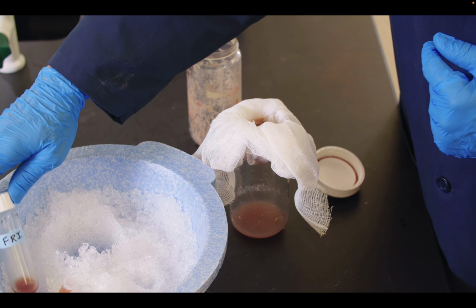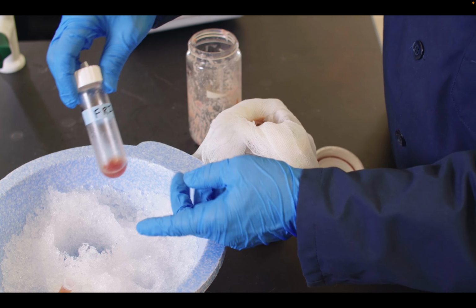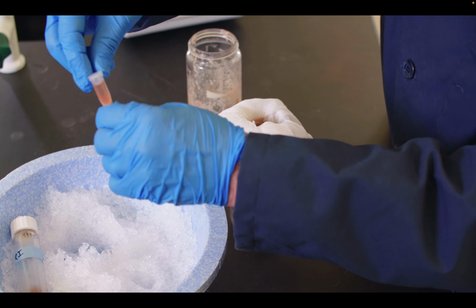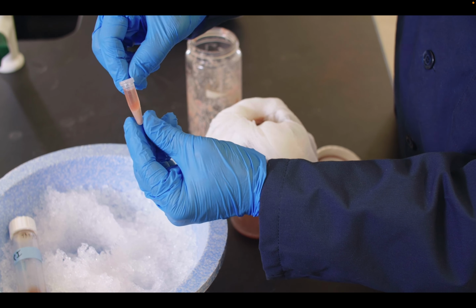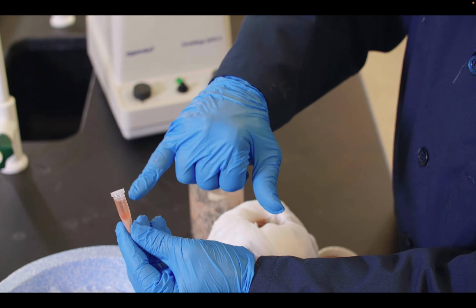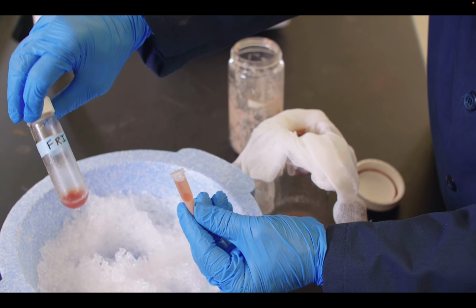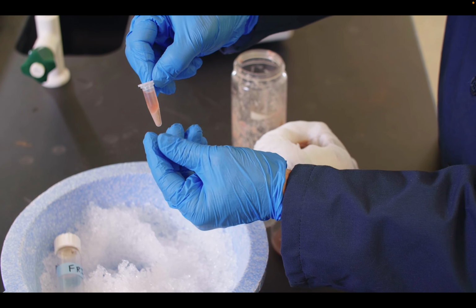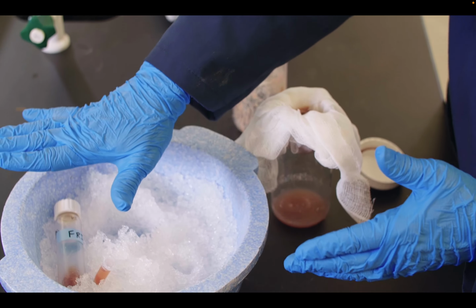Recall again that fraction 1 was really the entire 75 milliliters that we had earlier. This was a portion of it, and so we actually centrifuged a little bit of it to get rid of any solids, and we took just a little bit of that to make sure it was really pure, and we used the microcentrifuge just to clarify a small amount. You can see we have some reddish solution here, and again, that's part of our FR1. So part of this, we centrifuge this whole tube to get rid of solid, and we centrifuge a little bit more, and then we will use this in an assay, our first GOT assay that we're going to do in just a second. All right, so this again is fraction 1, all 75 milliliters, and split up.